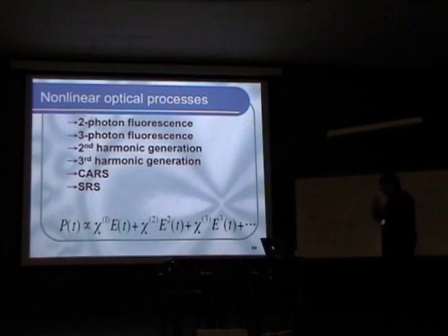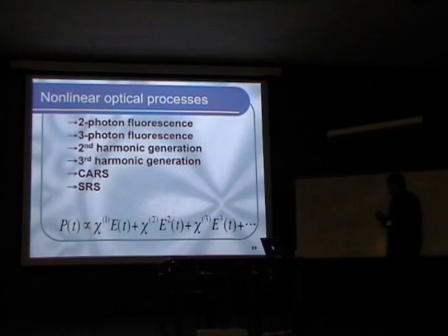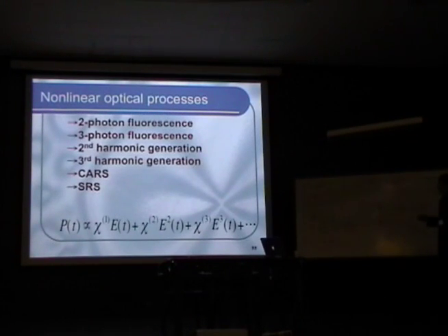However, the recently developed nonlinear optical microscopy techniques utilize the processes that would be described by the second and third terms in this expression, and those include two photon and three photon excitation fluorescence microscopy, second and third harmonic generation microscopy, coherent anti-Stokes Raman scattering microscopy, and also stimulated Raman scattering microscopy. Right?